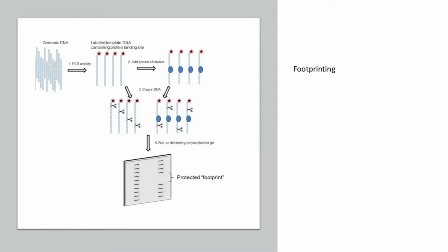After cutting, fragments of DNA molecules remain, and there is no radiolabeled band corresponding to the protein binding site on autoradiography of the polyacrylamide electrophoresis gel. The footprinting method has high specificity, accurate positioning, and is widely used.